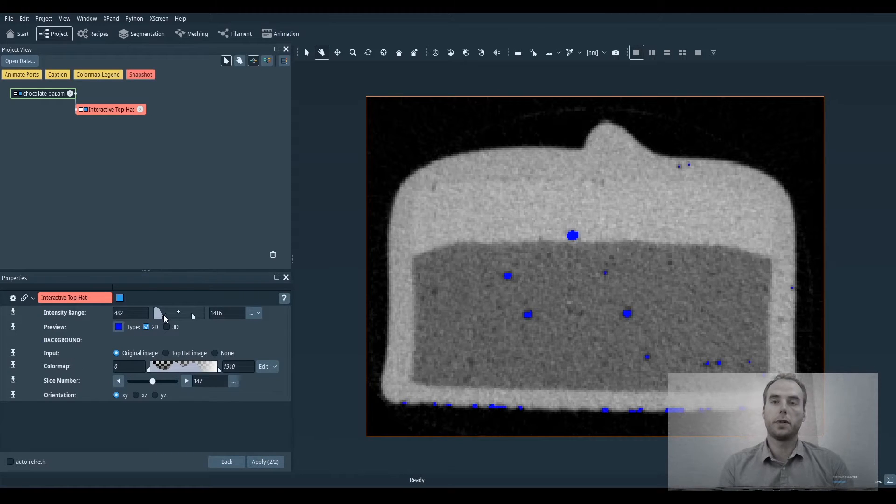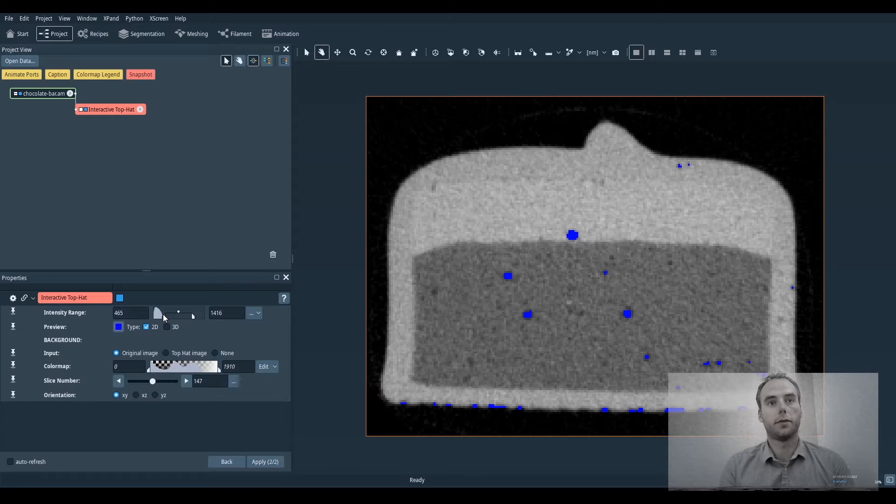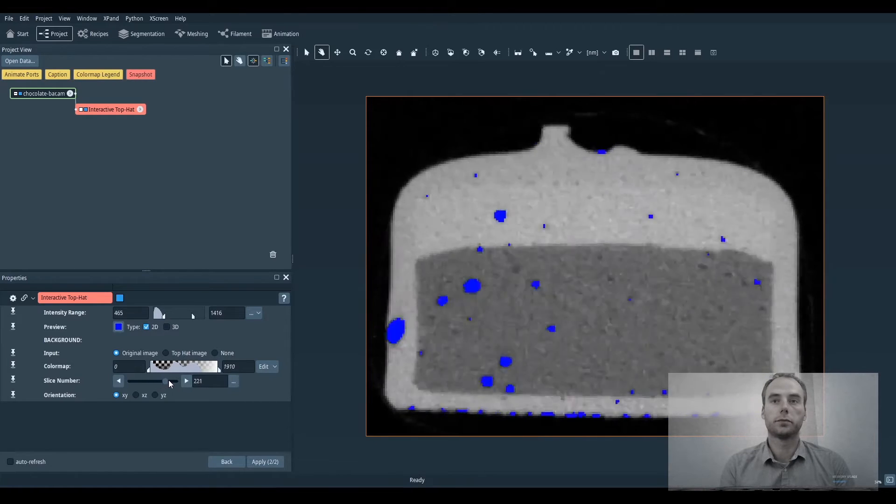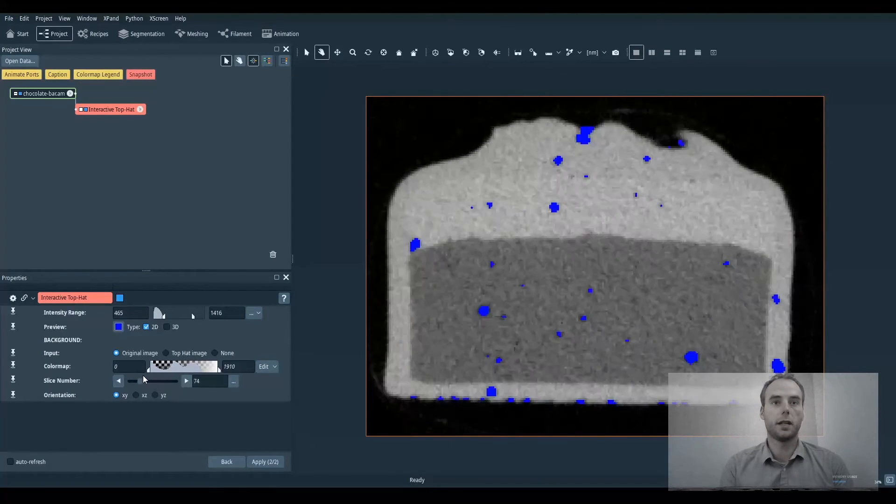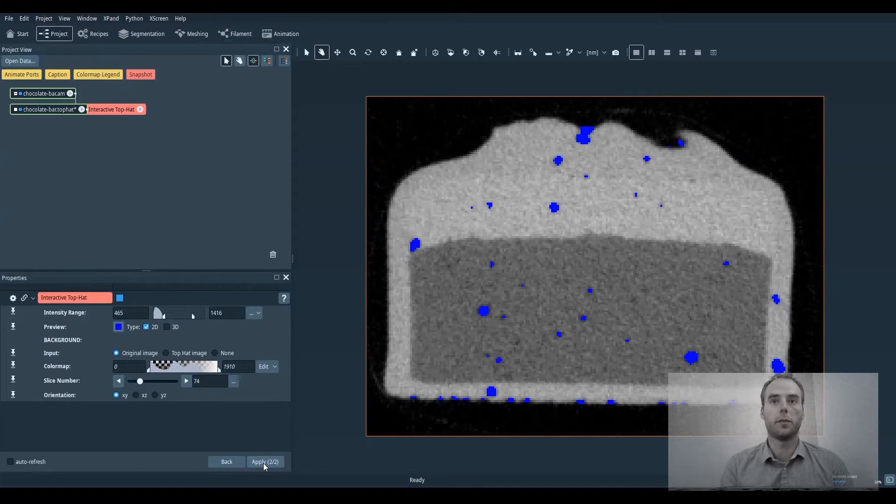Then the second step is to set the threshold of the segmentation. We check on every slice and when we are satisfied we click on apply.